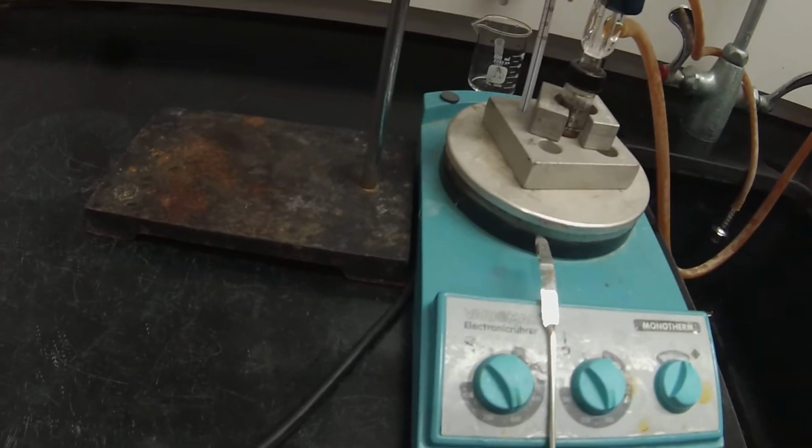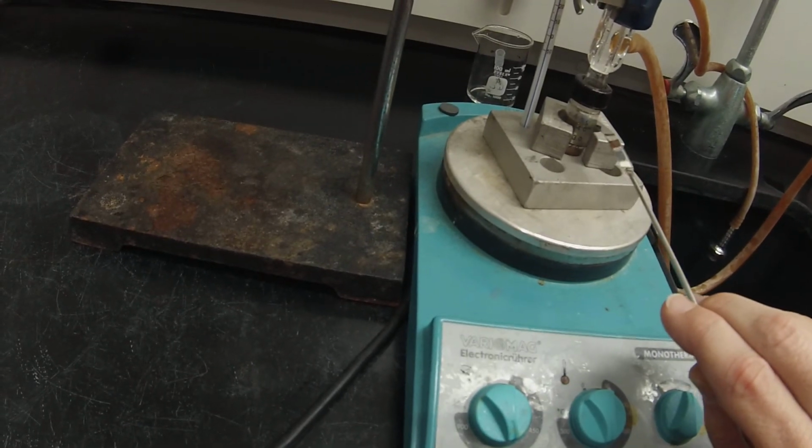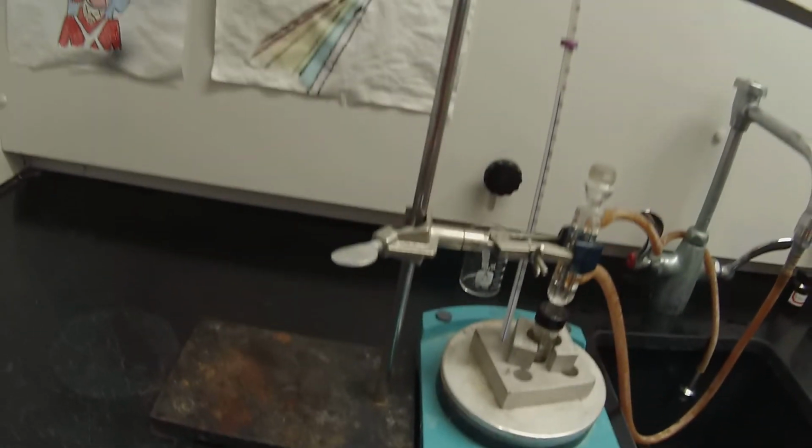So you can start to see that there's definitely vapor kind of condensing at the top of the vial. We're getting up close to 140.